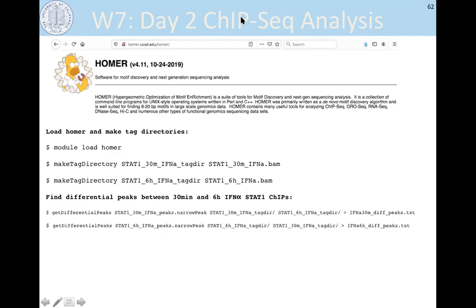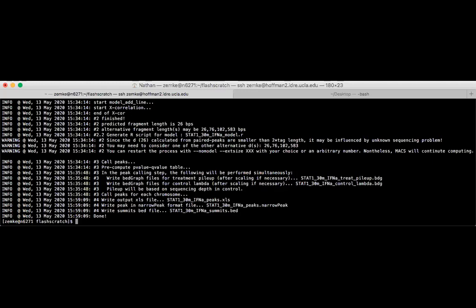All right. So in order to do this, though, we have to make sure our peak calling finished for both of our files. For me, they both finished. Hopefully they finished for you too. I'm not sure when this finished, but since they did, I will now start with the differential peak calling.